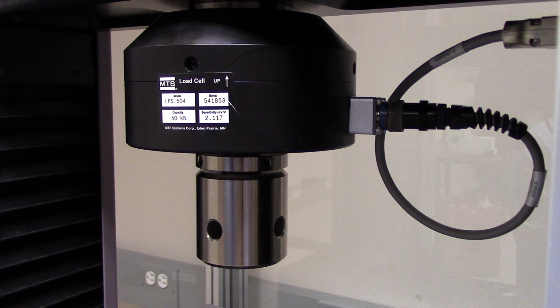If you don't know what type of load cell to use, make an educated guess and select a load cell with a higher maximum force than what you think you need. Be careful when doing this so that the force that you're exerting does not exceed the maximum threshold of the load cell. Let's go back to actually placing the load cells now.